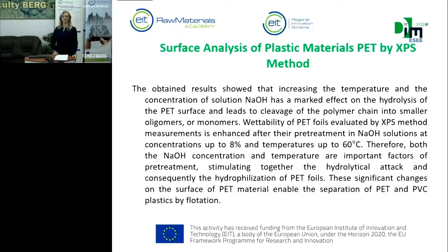Wettability of polyethylene terephthalate foils evaluated by XPS measurements is enhanced after their pretreatment in sodium hydroxide solutions at concentrations up to 8% and temperatures up to 60 degrees Celsius. Therefore, both the sodium hydroxide concentration and temperature are important factors of pretreatment, stimulating together the hydrolytical attack and consequently the hydrophilization of polyethylene terephthalate foils.